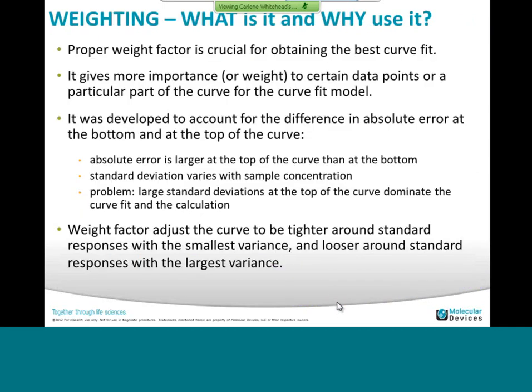So now we have covered the curve fitting. We're going to move on to weighting, what it is and why to use it. Choosing the proper weighting factor is crucial for obtaining the best curve fit, and therefore finding the curve fit parameter values that make the chosen curve fit model as close as possible to the measured data points.